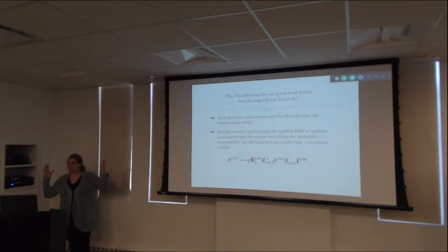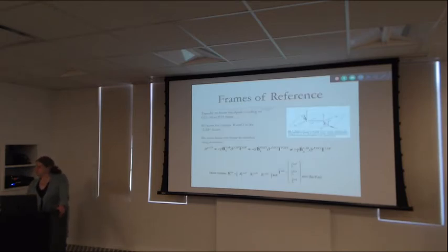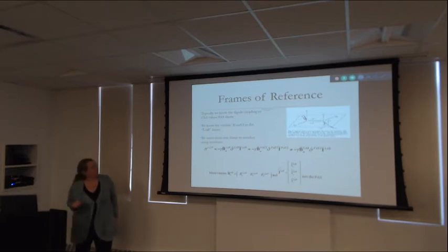But so that I can multiply it by a PAS that I got out of a paper that's in principal axis coordinates, I'm going to rotate those vectors into another frame. So this is where we start to remind ourselves how to rotate things. And then we talk about rotation for like 20 slides. Okay? So we're about to go into endless discussion of how to rotate things.